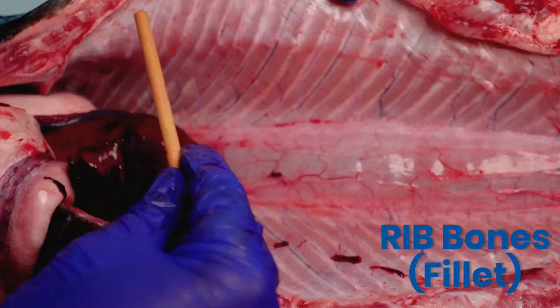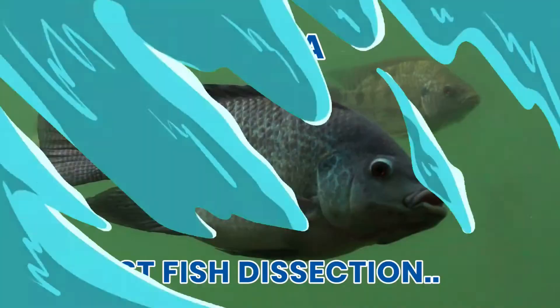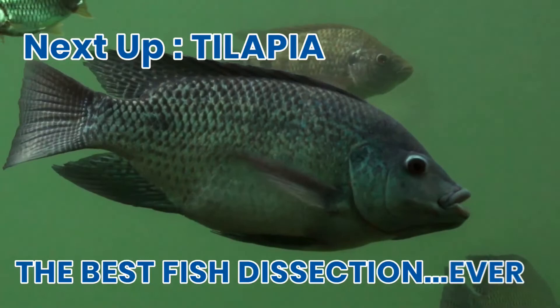I hope you stayed to the end of this video to see the salmon brain. The brain is located just behind the eyes. For UC Davis Aquaculture, this is Dr. Jackson Gross, and this has been the best fish dissection ever.